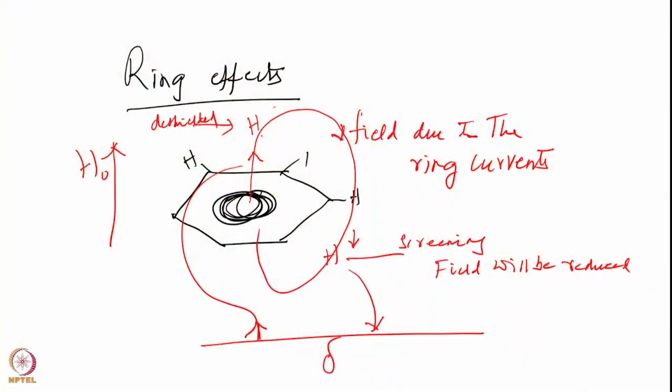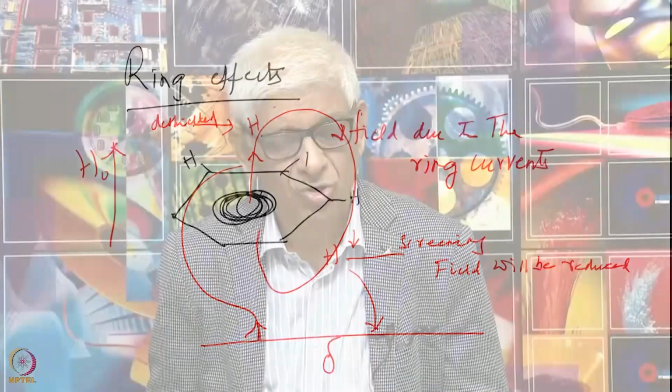Okay. Of course, I talked to you about the proton chemical shifts, the same thing will apply to the other nuclei as well. C13 shifts or nitrogen 15 shifts, the same principles hold good whether it is a proton shift or carbon shift or nitrogen shifts or phosphorus, whatever nucleus you are taking, the general principles are the same.